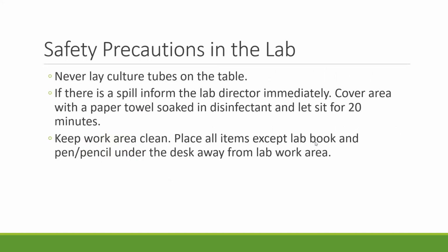So as we talk about the lab setting, even though this is online, you still have to come away with some of those concepts, because they do get applied to clinical settings or to other courses that you may have for higher level sciences, etc. When you're working in a lab, there are some safety precautions that you want to ensure, especially with your lab bench and your tools that you use.